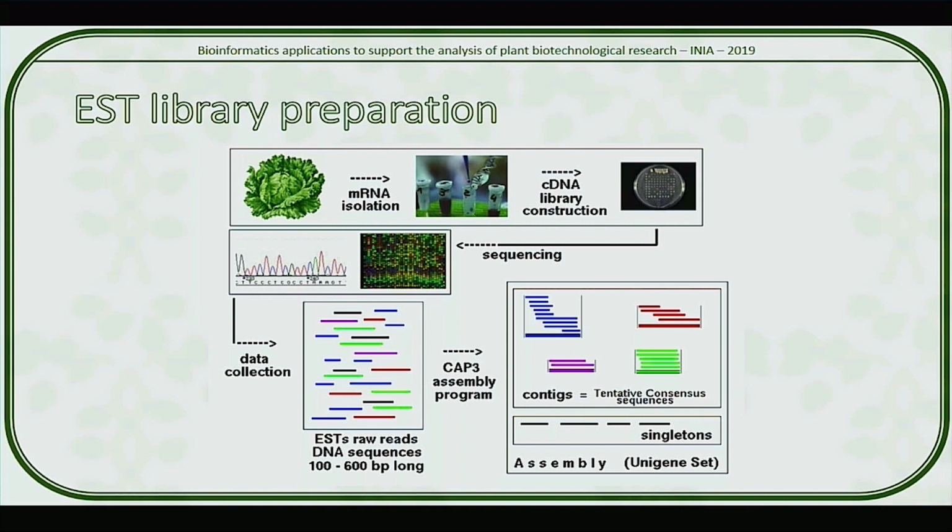Then we construct the cDNA library by cloning all those fragments that we have selected into bacterial vectors, and then transforming bacteria with a different vector each, so that we have a collection of bacteria. Each of those bacteria will have a different fragment inserted in the vector, and each fragment will represent an active transcript. That's basically what we did in these first two steps.